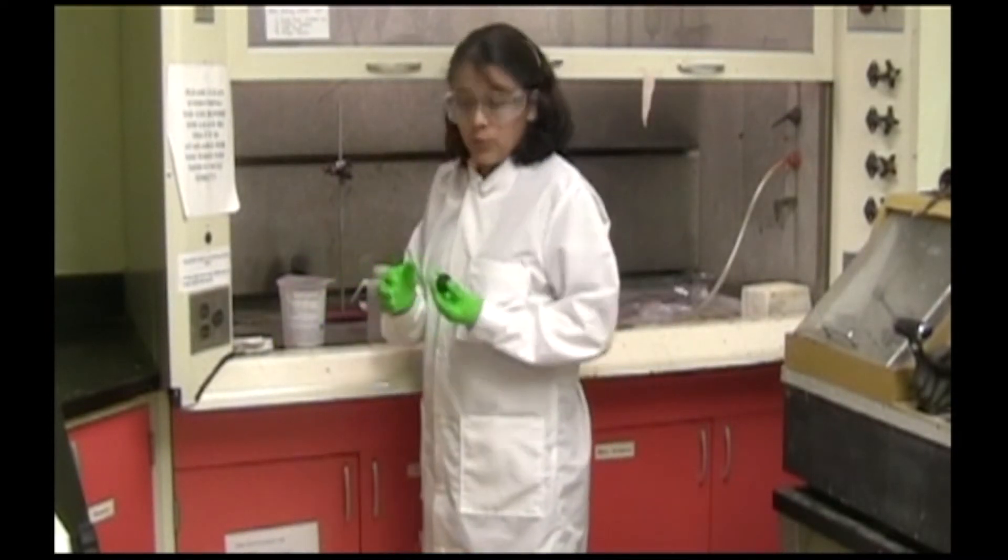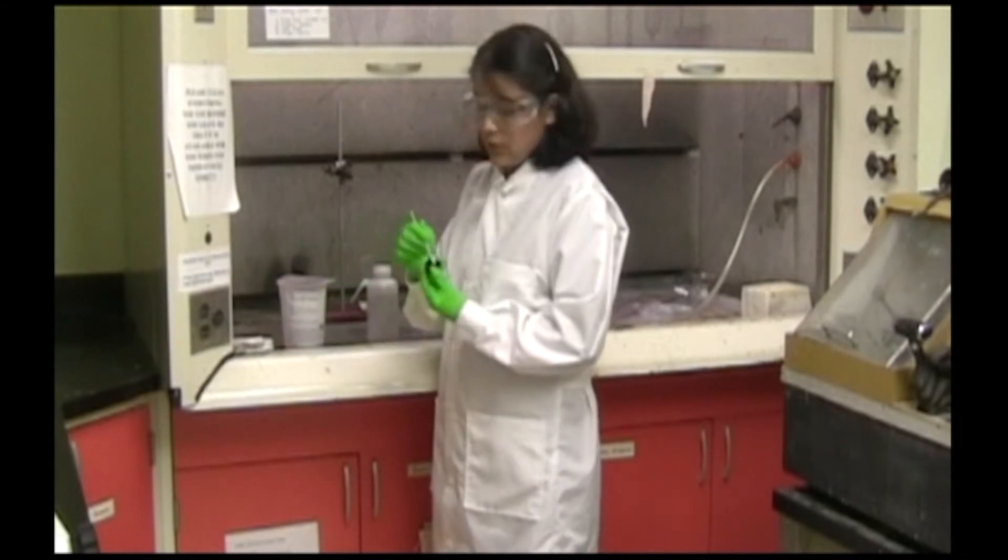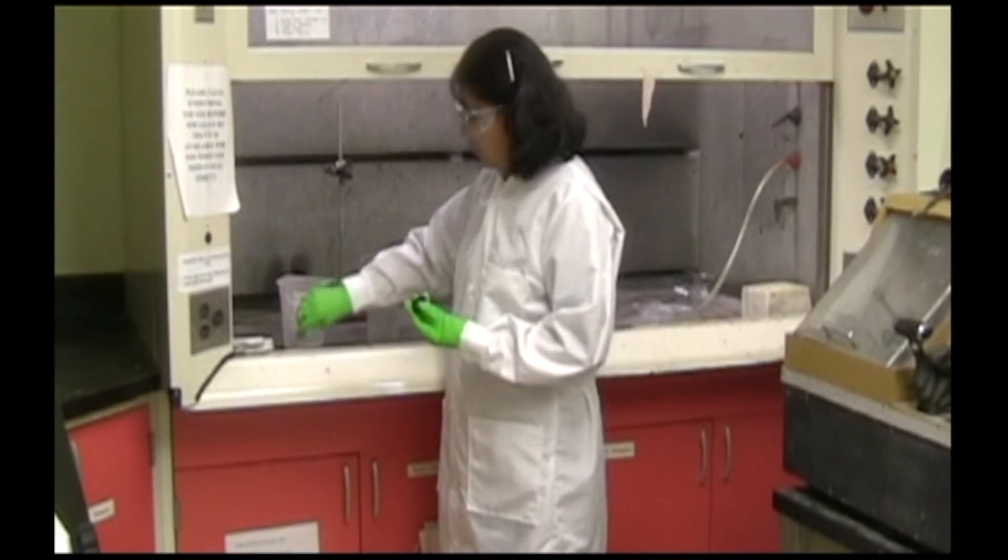When you're etching your sample, you put the etchant on your sample surface, and you can use a cotton swab to spread it out.